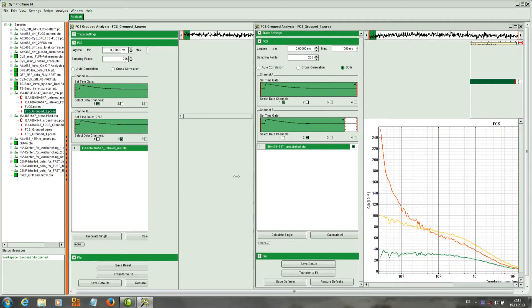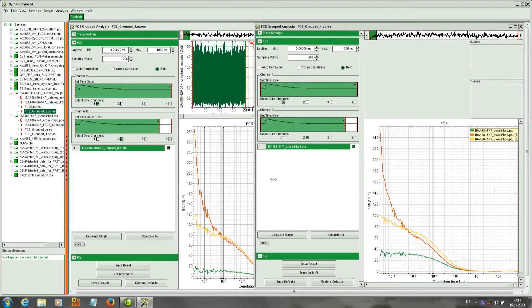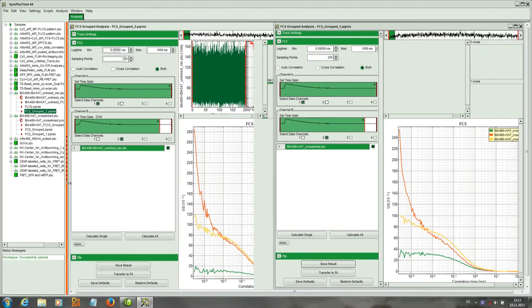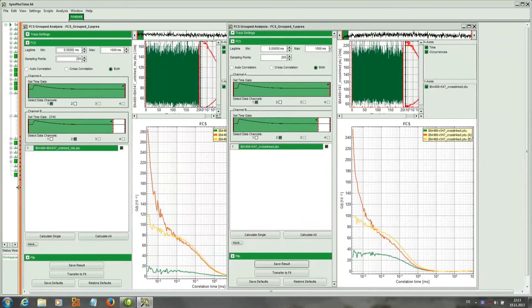If the area is a little bit small on the screen, you can also just decrease the workspace area.